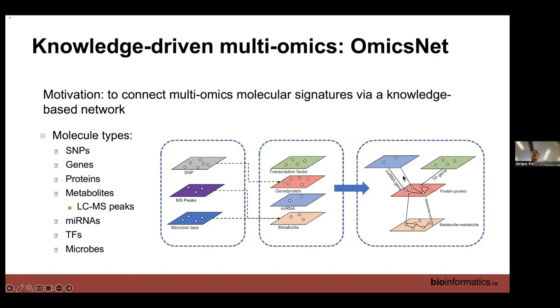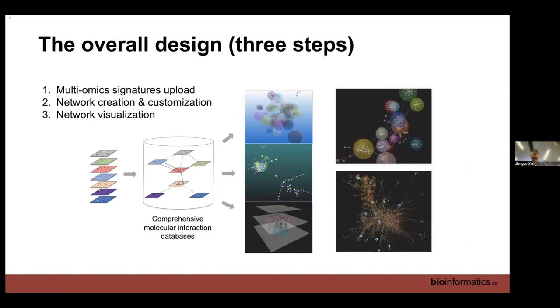connect the dots and have edges established. And suddenly, it's not individual dots, it's connected dots. Once it became connected dots, it became a network. And now you can do a lot of network analysis.